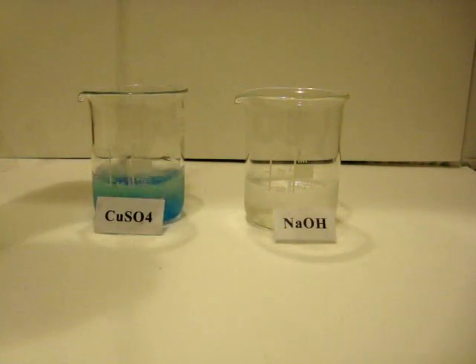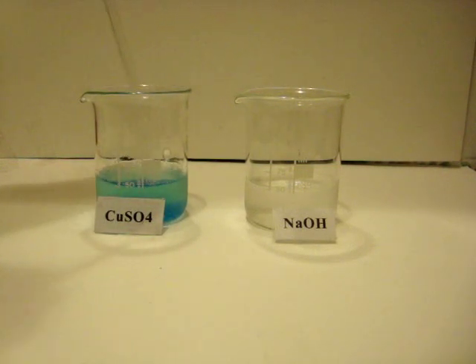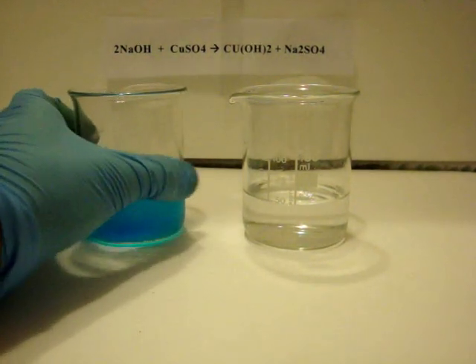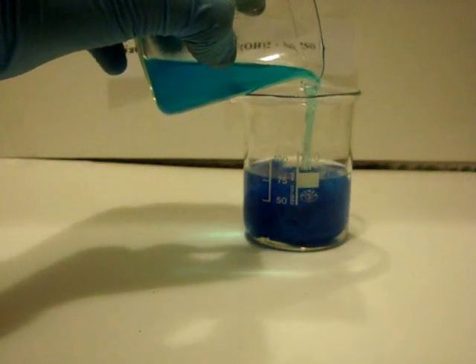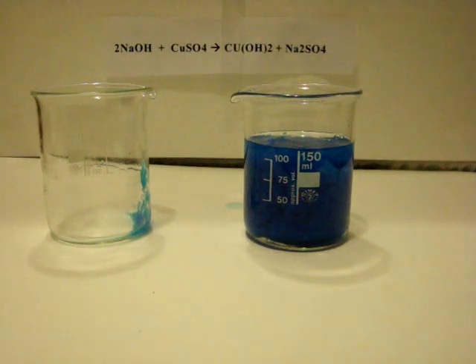If you've got a magnetic stirrer, it's better. Since I don't have it, I'm using a glass pipette. Working fast, add the sulfate solution to the other one. A precipitate of copper hydroxide forms instantly. This is the reaction: CuSO₄ + 2NaOH → Cu(OH)₂ + Na₂SO₄.